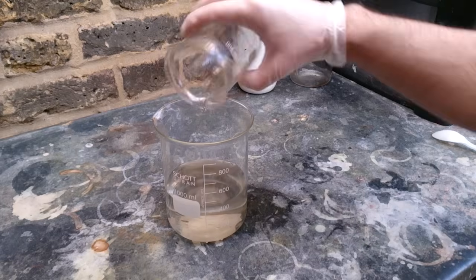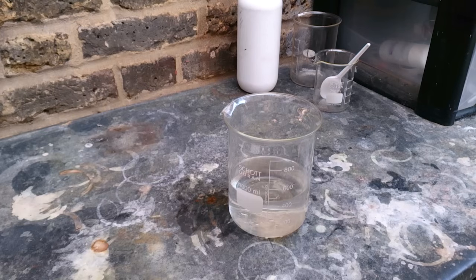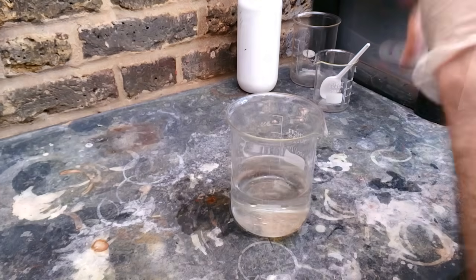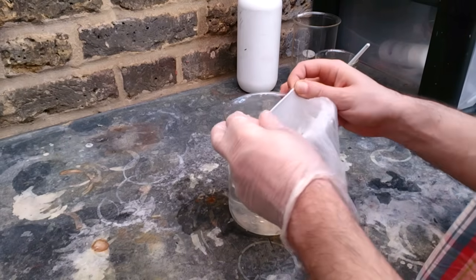After mixing everything together, just leave it to sit at room temperature for one or two days. Also, I want to show you a little trick about covering your beaker in case you do not have a flask.